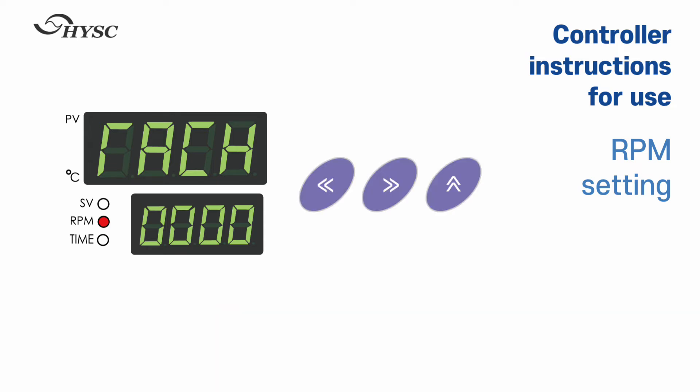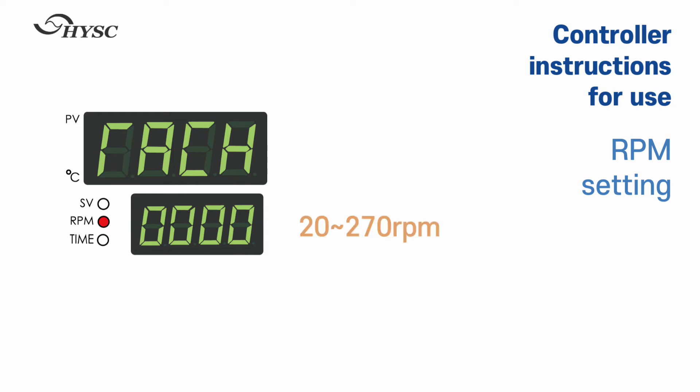Set the speed using the digit shift keys. The RPM range to be set is between 20 to 270 RPM.